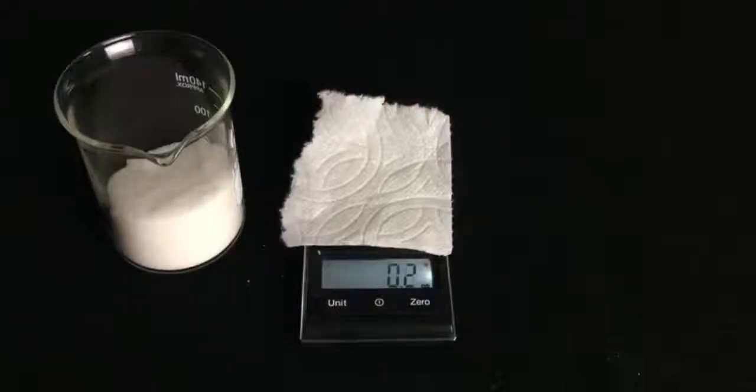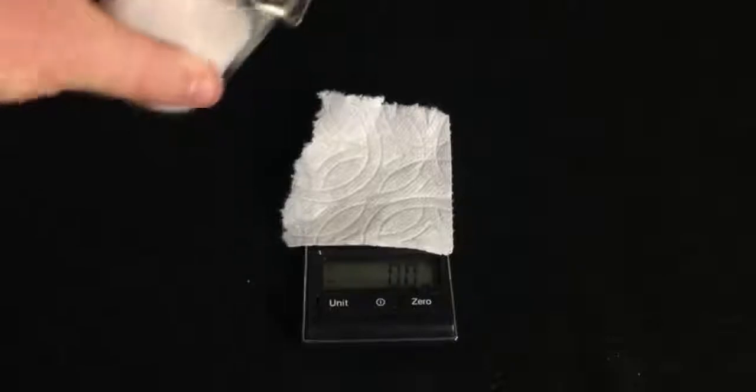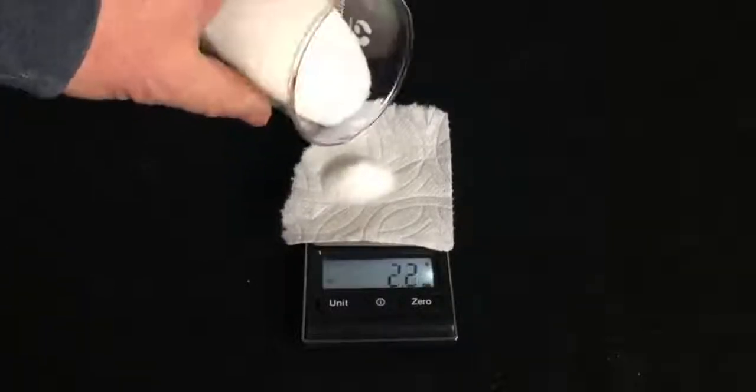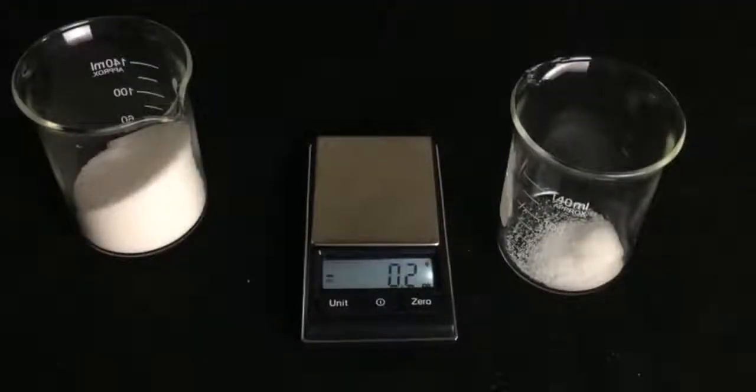So I place a little piece of paper on the scale to hold my sample, zero the scale, then add some sugar until the scale reads precisely 2.5 grams. There we go. Now I place that in my beaker.